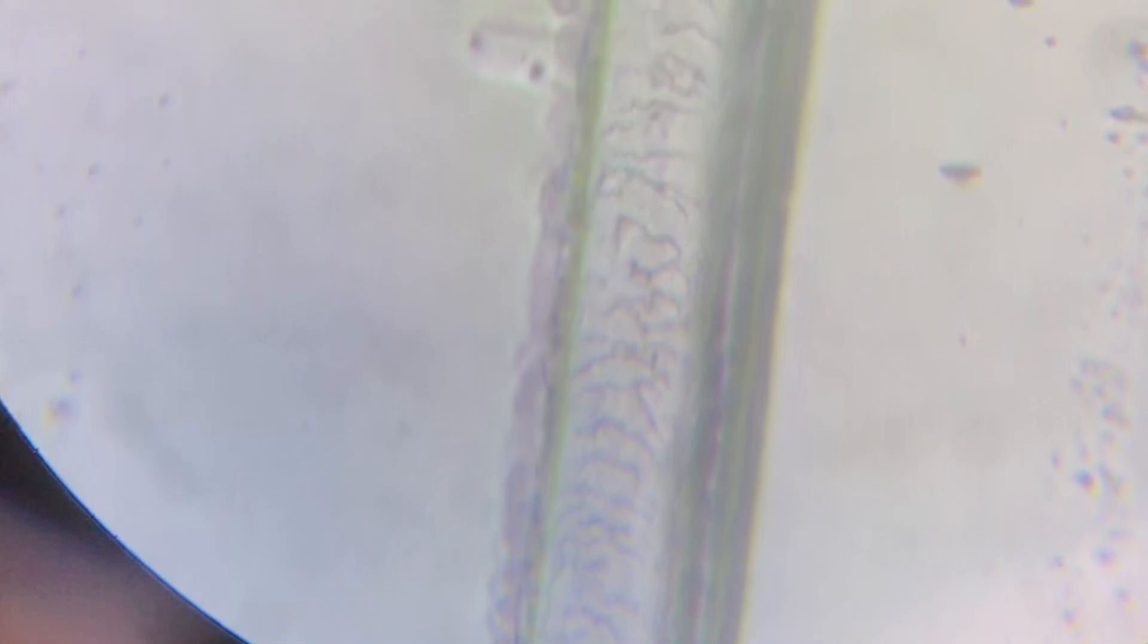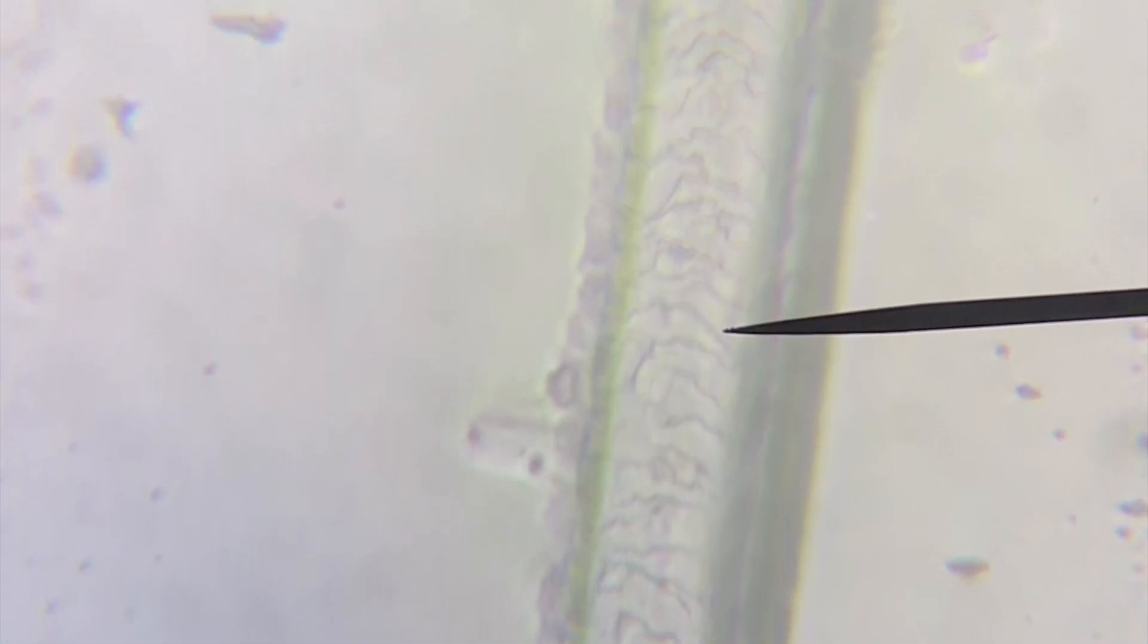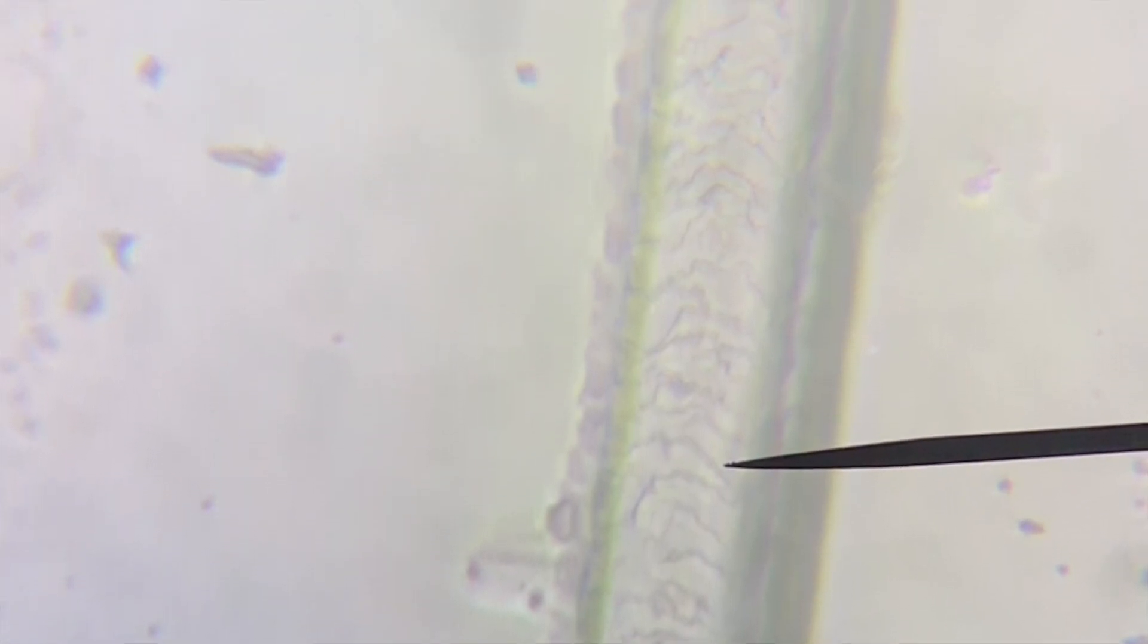So here we can see that I was able to get a pretty good cast impression of my cuticle. You can see how the direction of the imbricate scales point from the bottom of the slide towards the top which tells me that the proximal end, the end that grew out of my scalp, is at the bottom of the slide while the distal end, the tip of my hair, is at the top of the slide.